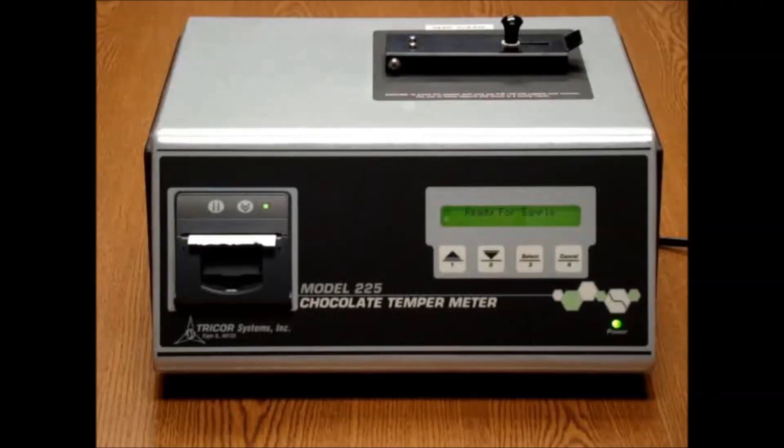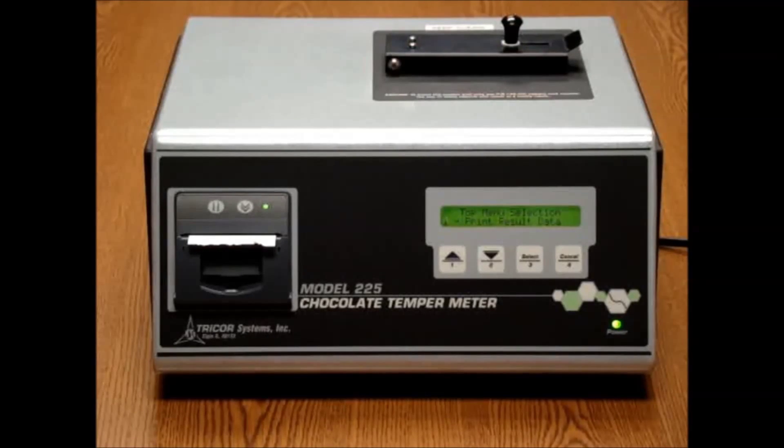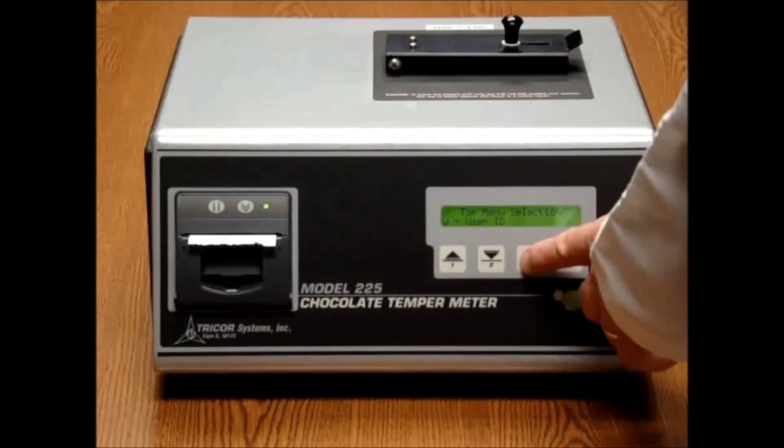When first using the system, the operator will need to determine what information they would like to capture on the printout. By pressing the select button, a menu will appear which will allow the user to set a number of different options. By using the arrow buttons, we are able to move up or down to the desired option, and by pressing select we can choose that option.